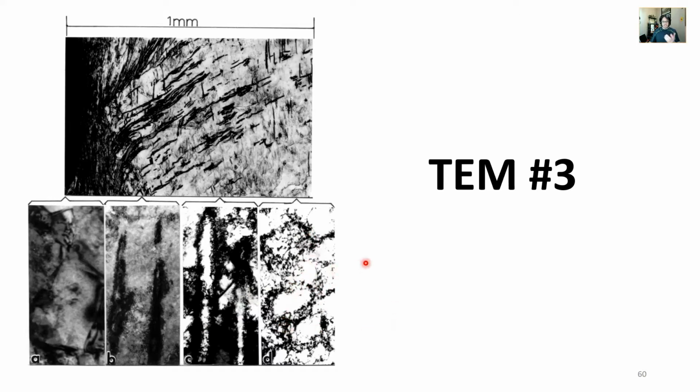Dislocation cells are kind of like grains, actually, and they do contribute to the strength of a material. So you can modify the Hall-Petch equation and add a term for dislocation cell diameter and estimate the effect of the presence of these dislocations or dislocation cells on the overall yield strength. It's a very interesting phenomenon.